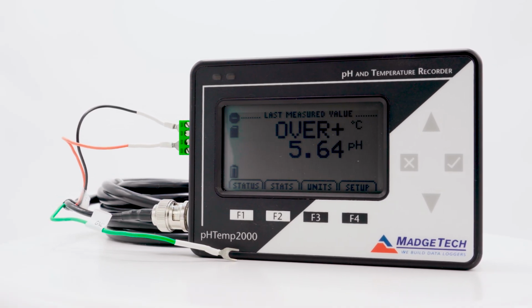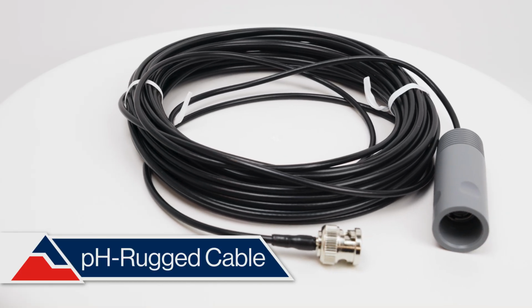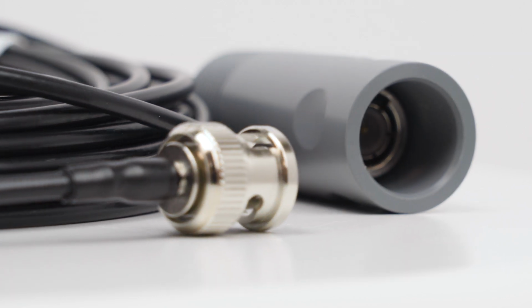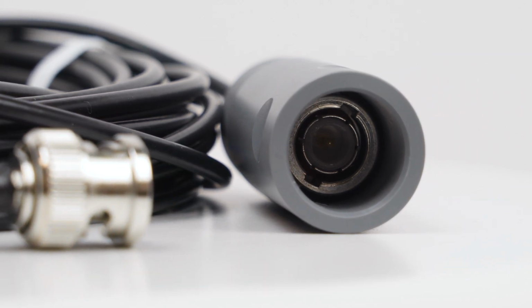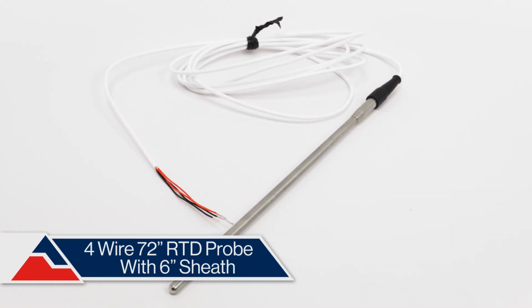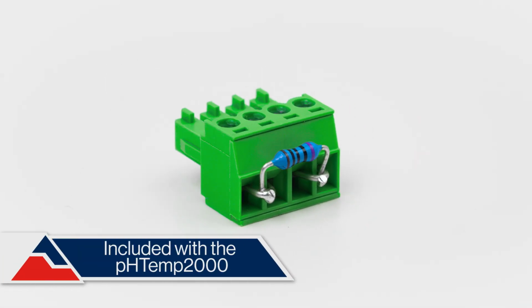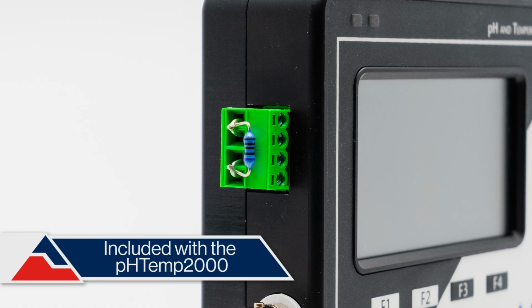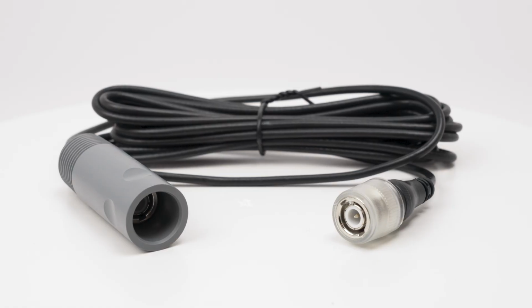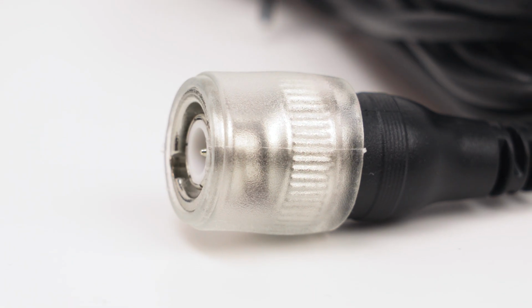The second mounting assembly option available to carry readings from the electrode to the data logger is the pH rugged cable, which is nearly identical to the ATC version, apart from not having an RTD probe built into the assembly. A separate RTD probe can be used in conjunction with the pH rugged electrode for automatic temperature compensation instead, and if the accuracy of ATC is not necessary, use the included resistor kit to simulate the temperature to minimize error. Some of the pH rugged cable options are available in more water-resistant fittings as well, so make sure to keep that in mind while searching for mounting assembly options.